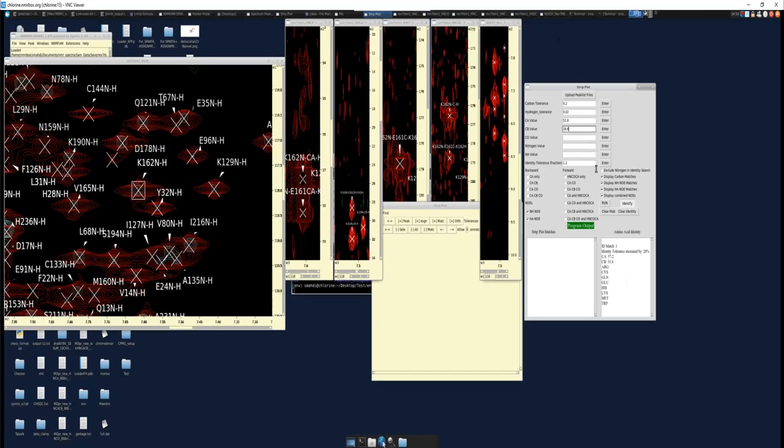sorry, NMR box is being a little slow today. If we look at here, oh, sorry, let me get rid of this. Did I click enter for both? Oh, interesting. There are 51.8, sorry, 58.1. I got these a little confused. Forgot to click enter. So now you can see you have an arginine, cysteine, glutamine, glutamic acid, histidine, tryptophan, right? So you have the exact same thing as last time except for a lysine.